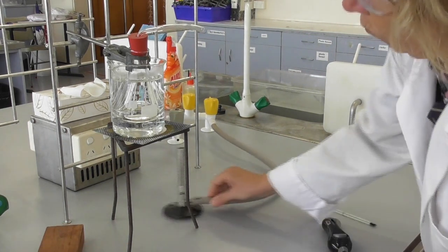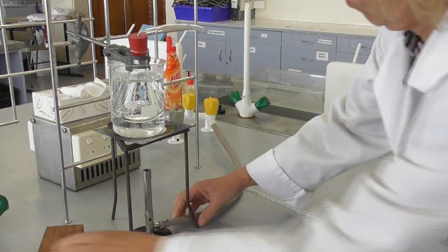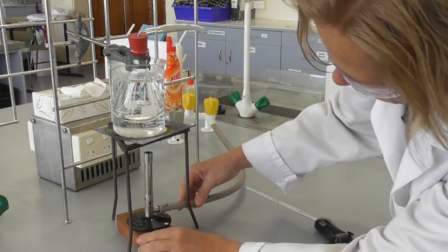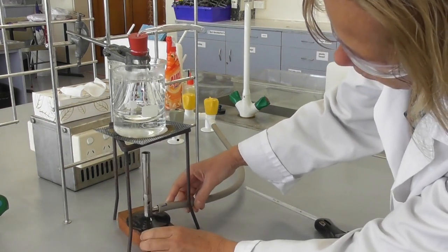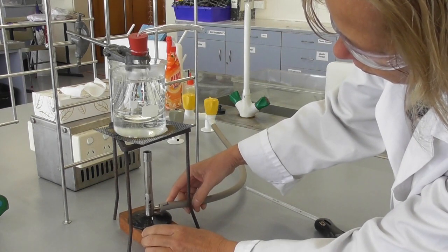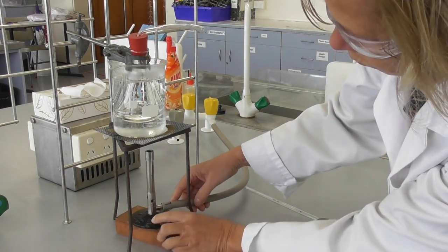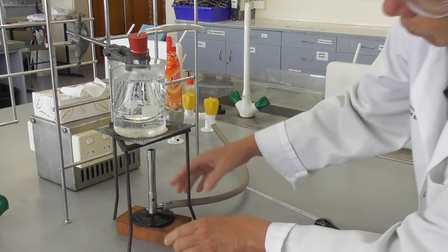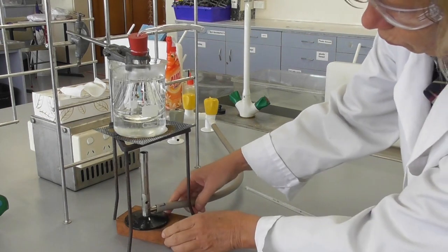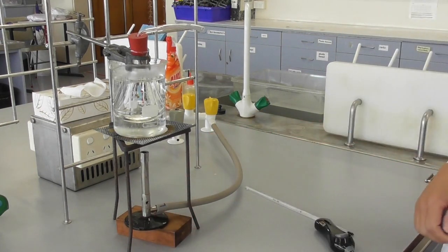We light a Bunsen burner, put the flame on hot and then raise it onto a wooden block to create more heat directly under the beaker. Then we wait for it to start boiling.